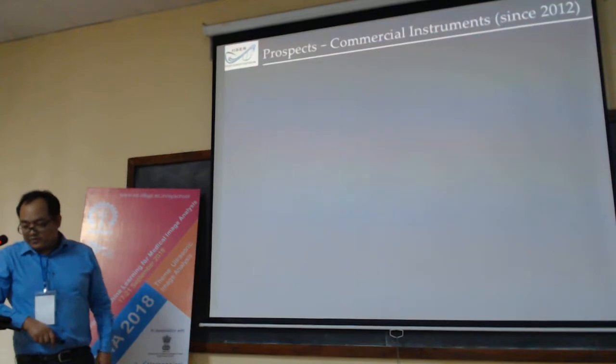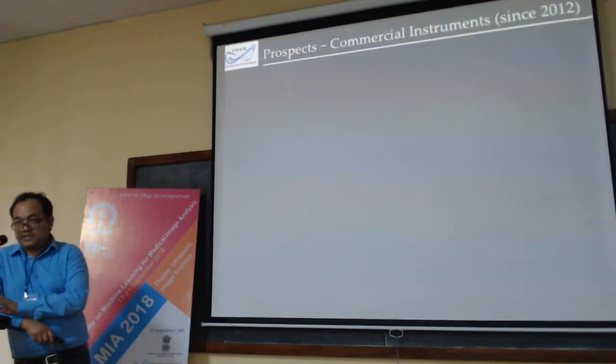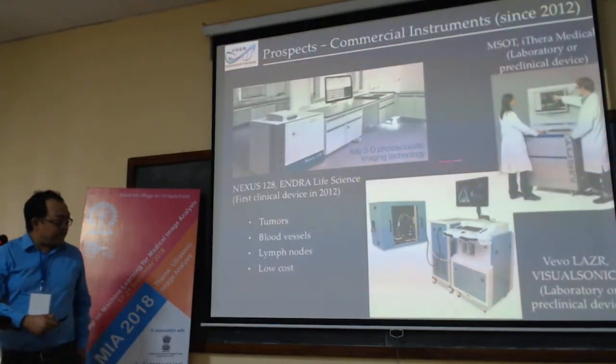From the prospect point of view, very recently, since 2012, clinical devices have been brought for commercial use, for research applications, clinical applications, and laboratory use. These are the companies that I found.